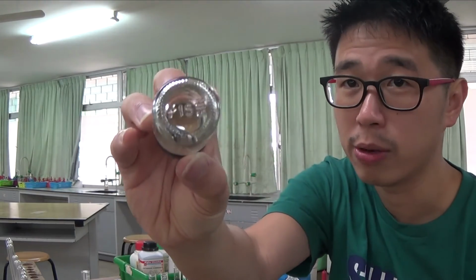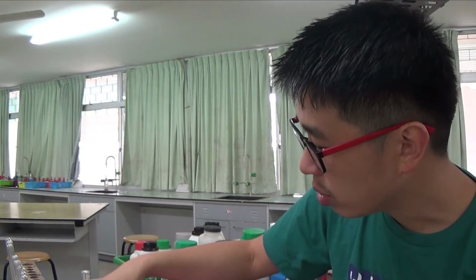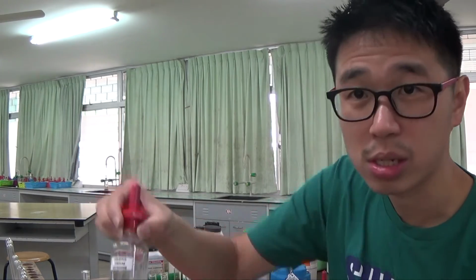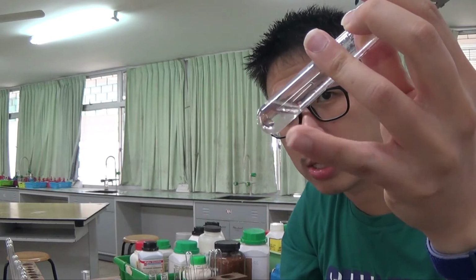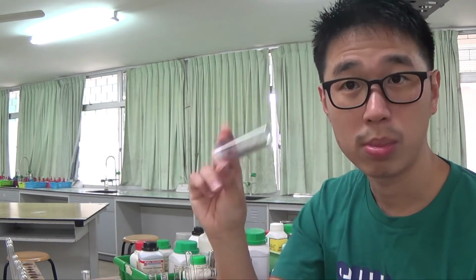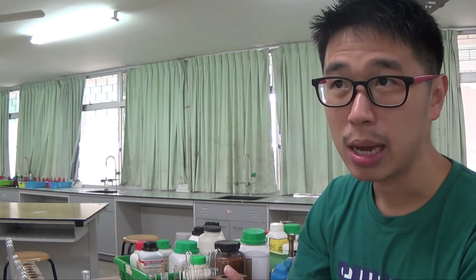Even without the aluminium foil, ammonium ion is NH4+. When you add sodium hydroxide, which is NaOH, to something that contains ammonium ion, and then you heat it, you will get ammonia gas that will turn red litmus paper blue. Okay, and there's something I'll do later on. So I will not test for nitrate here until you test for ammonium first.